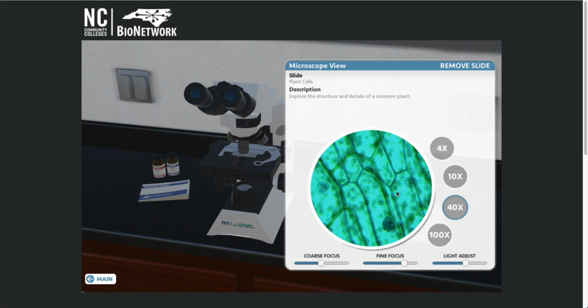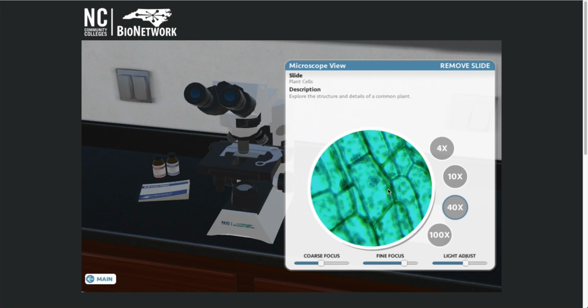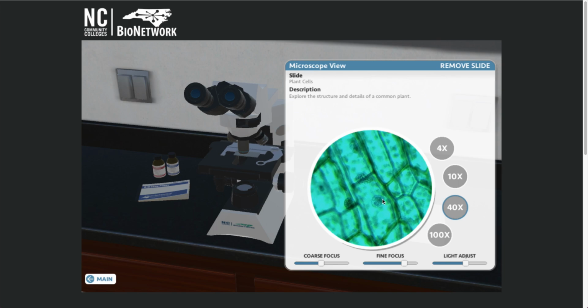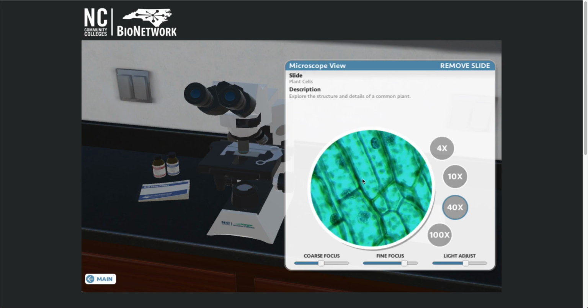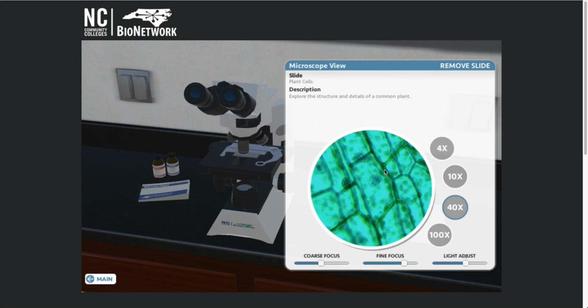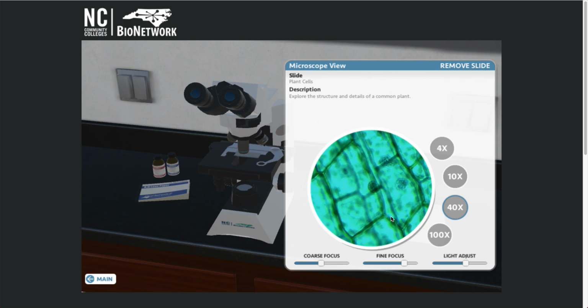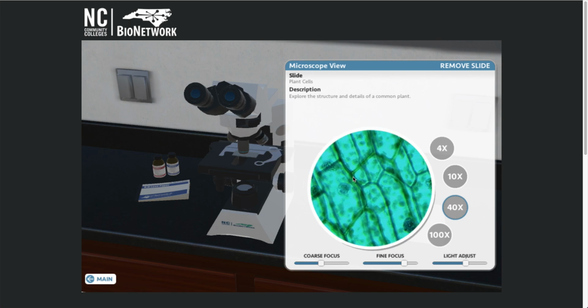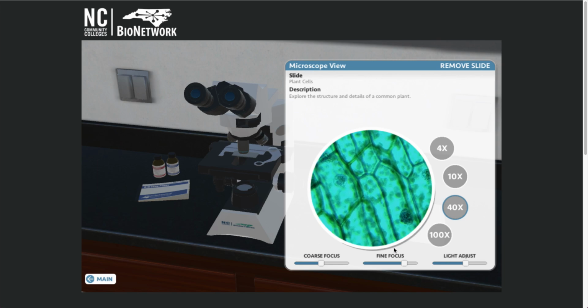What you're looking at are called plant cells. Plant cells look like they're lined up like bricks. This is how Robert Hooke called them cells, because they looked like the cells of a monastery. Down here, this is called the nucleus of the cell. This entire portion here is a cell. We have another cell here. We have another cell, okay?